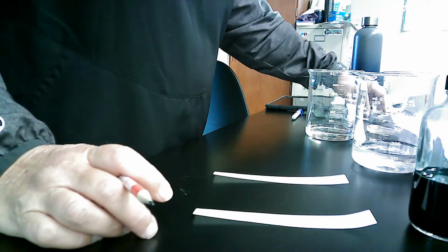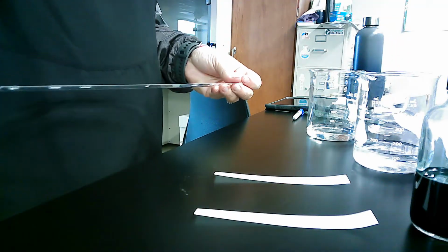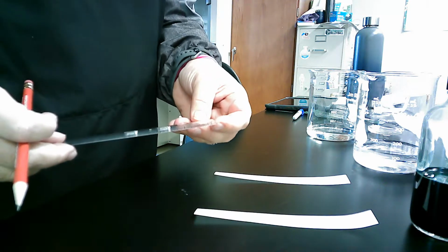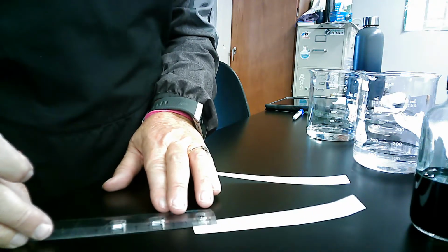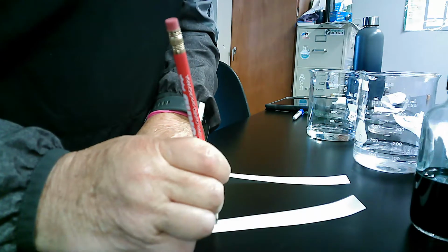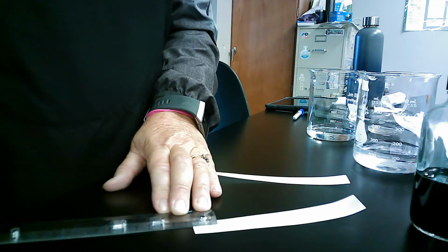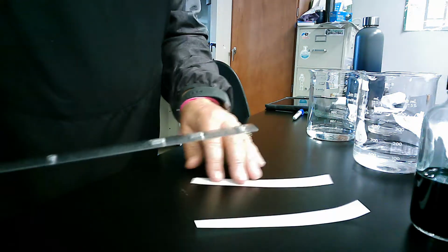So the first thing I need to do is set my line that's going to be my starting line for my chromatography paper. It's important that we're not touching the paper very much because we want to avoid getting oils and things from our hands on it. So I'm going to go up about 15 millimeters, maybe a little bit more, and make a line.